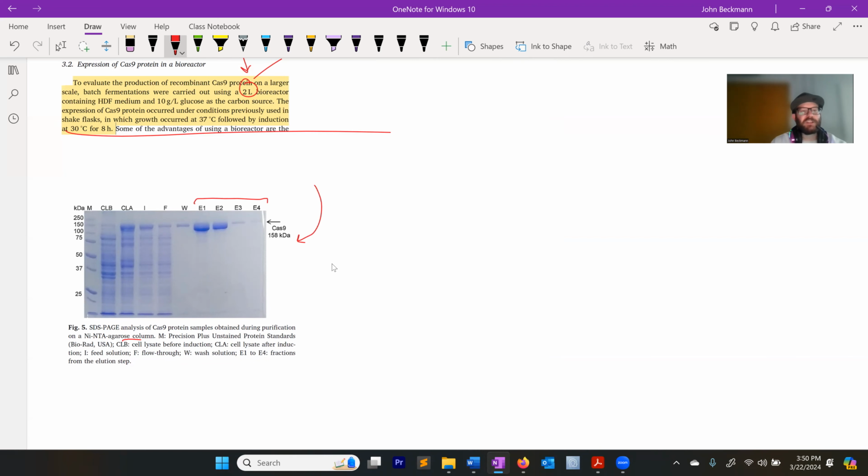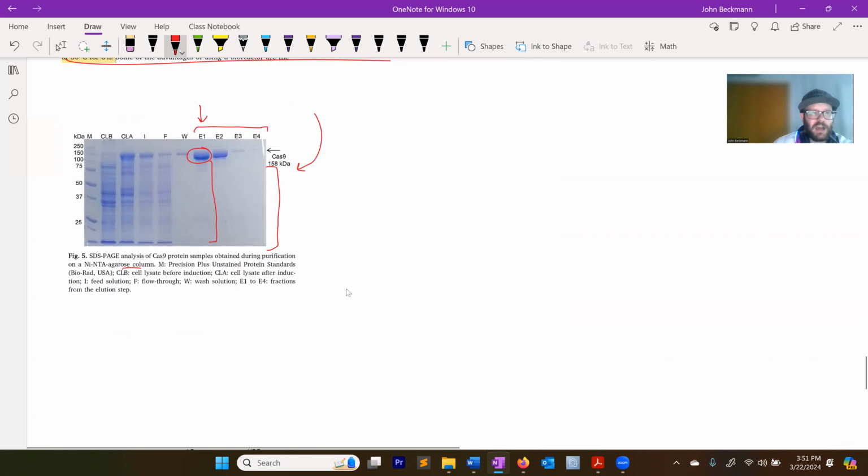It gets less and less because the first elution is obviously going to strip off most of the Cas9. So that's readily understandable. Now, when you look at this purification scheme, would you say that this is a clean product or a dirty product? This is very clean, okay? You have very purified, highly abundant product, and there really isn't anything else in that sample. SDS-PAGEs are always run and shown in recombinant protein expression papers as a demonstration of how pure the product is. And this is a very visually pure product. So they did a great job here getting the Cas9 highly pure.